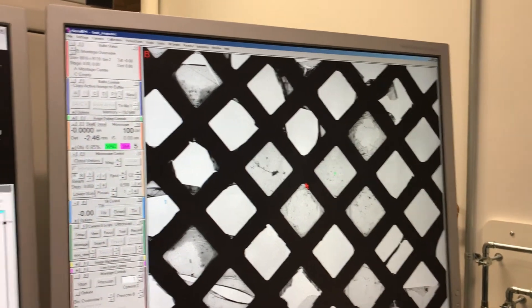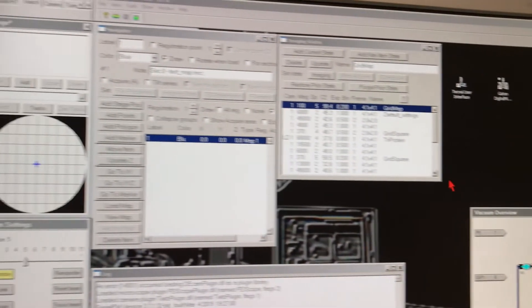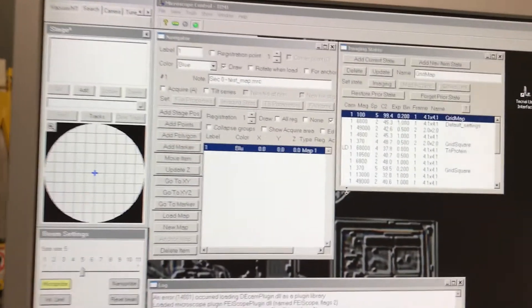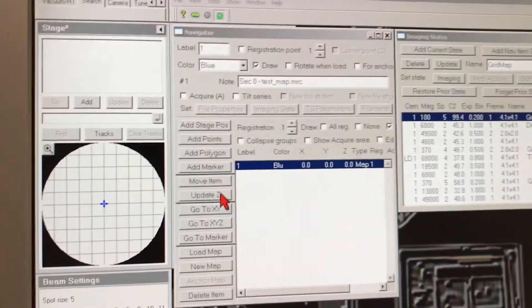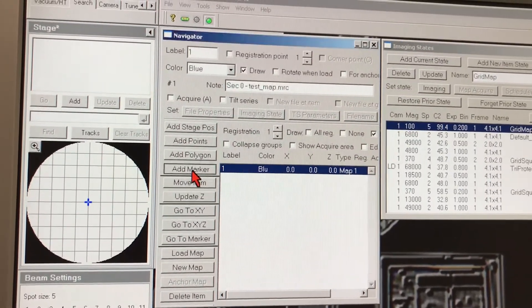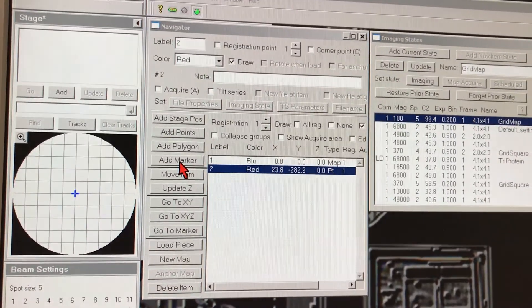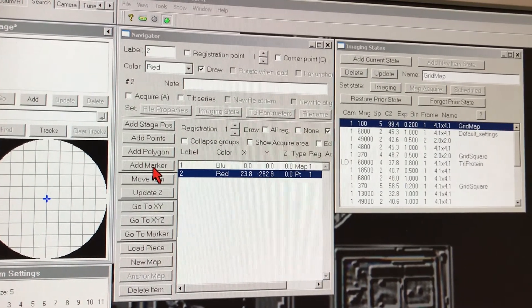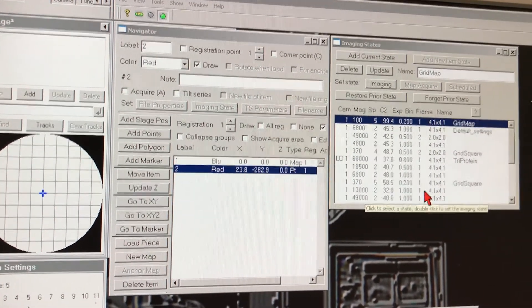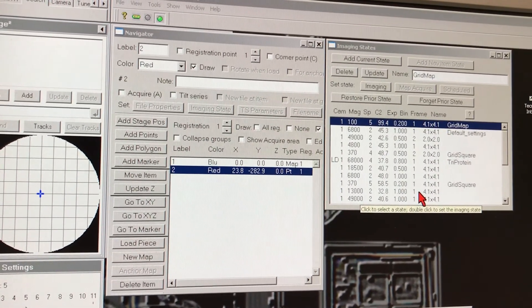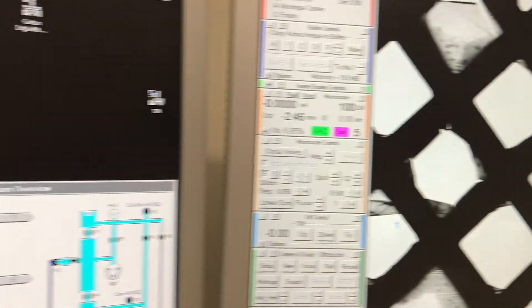So we select a few areas like this, and using the Navigator option on the other screen, which is part of SerialEM, we can save the areas of our interest so that we can go to each of them and take a look at the protein that we negatively stained for this grid.